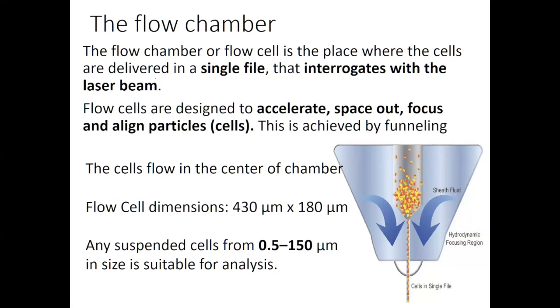See, if you ask me to observe just one person, I can observe him properly, say from head to foot. If you give me a group of people and say observe everyone, my observation may not be that great, right? So similarly, the laser beam should hit one cell at a time for a proper scatter and proper fluorescence, or capturing the fluorescence and emission, right? So that is the reason behind the importance of hydrodynamic focusing, to make the cells or particles go in a single file pattern.